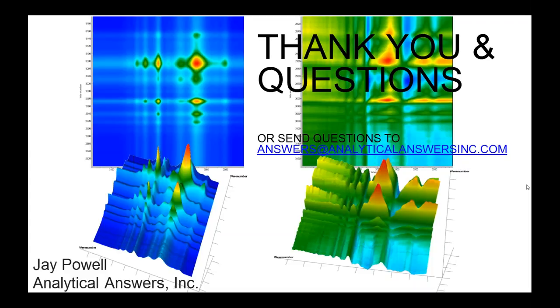If the adhesive is on a polymer substrate, like the example I gave earlier about the polyvinyl alcohol between the polypropylene, perhaps the molecular imaging might be useful in monitoring that migration. Another technique that has been used as well, depending again on the substrate and the material, is a technique called photoacoustic depth profiling. I showed you the PAS, or photoacoustic sampling accessory we have up there. This gets into a rather involved analysis.